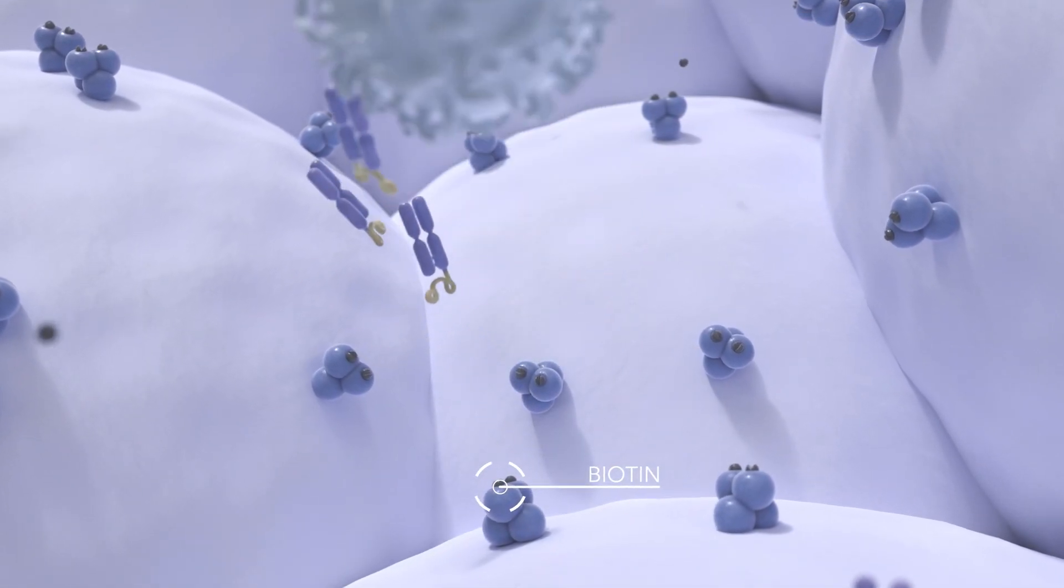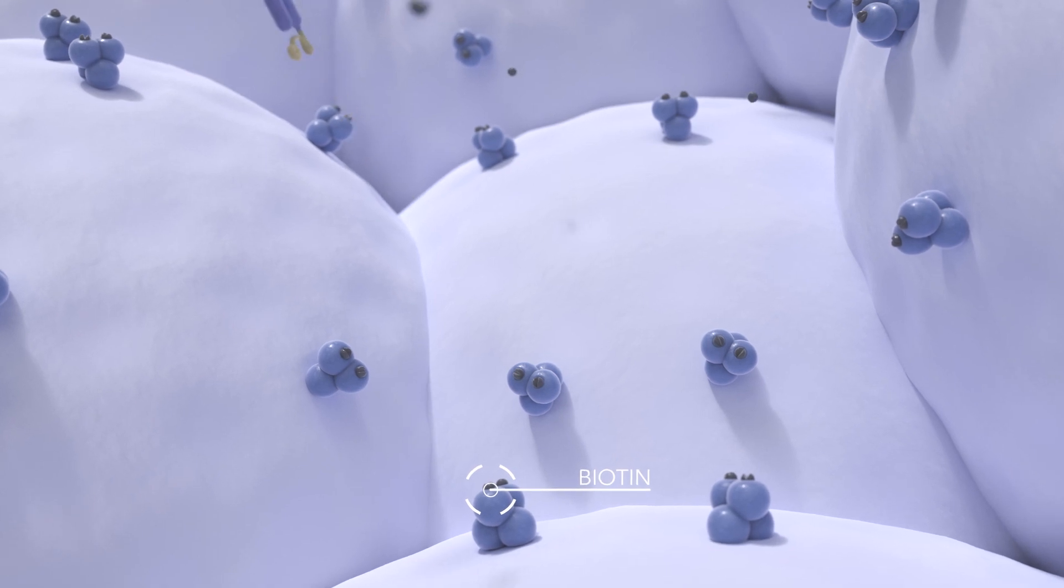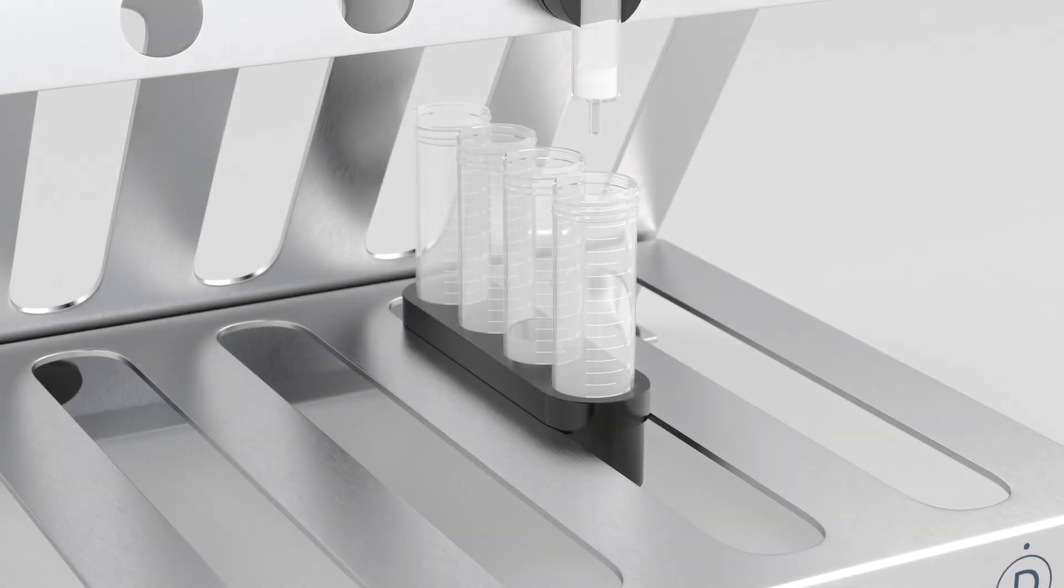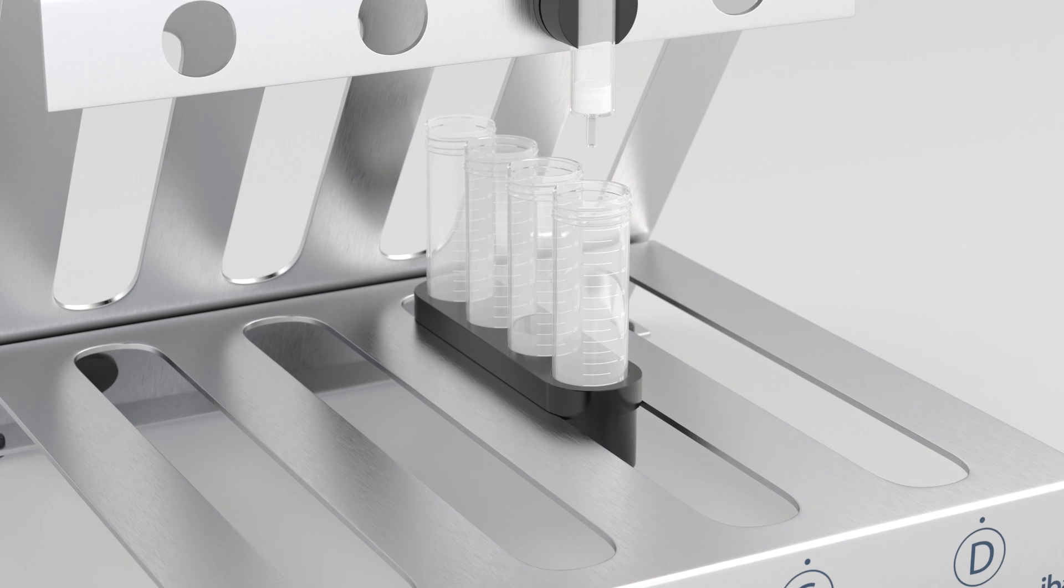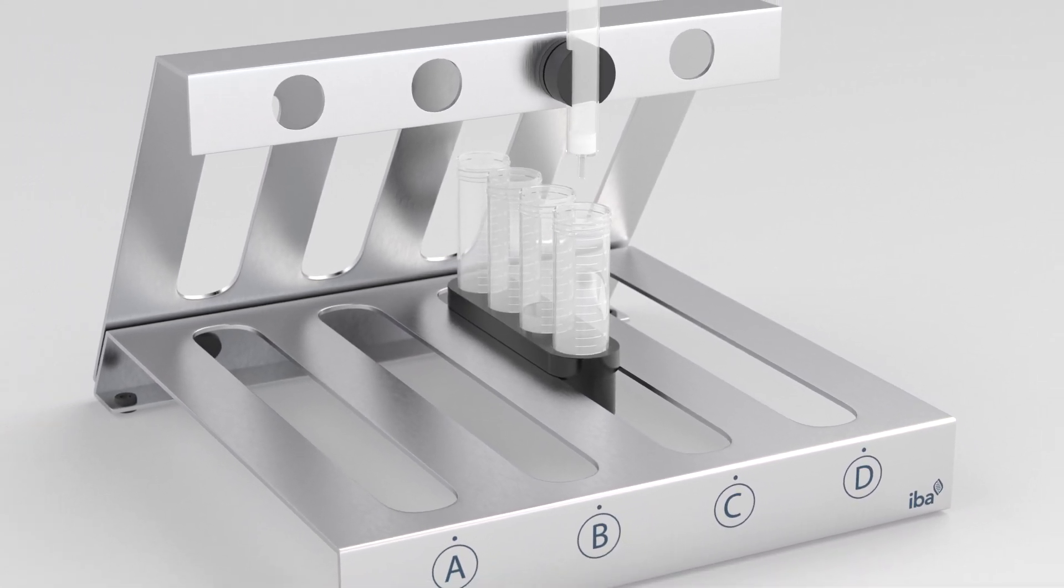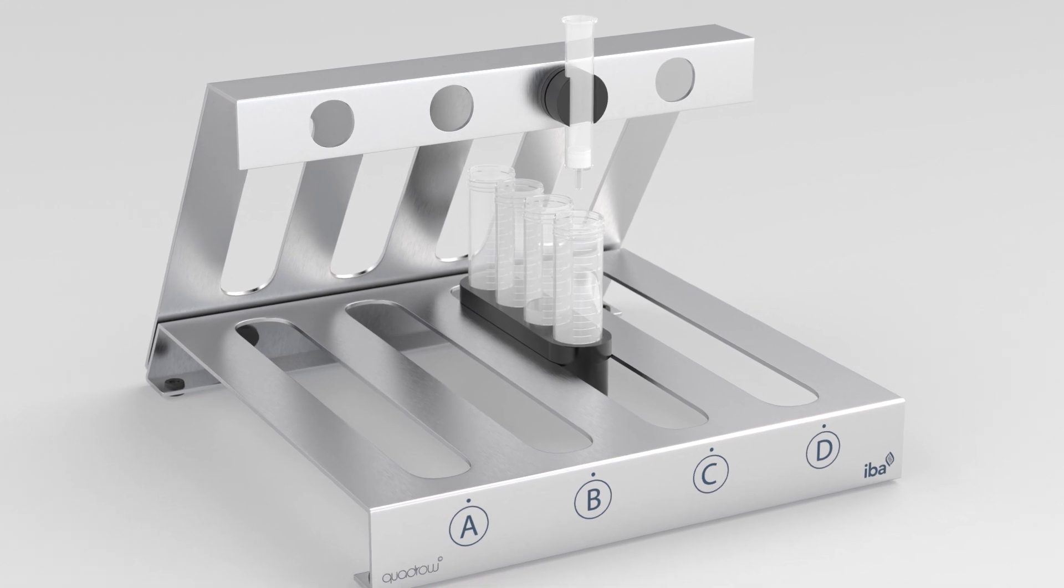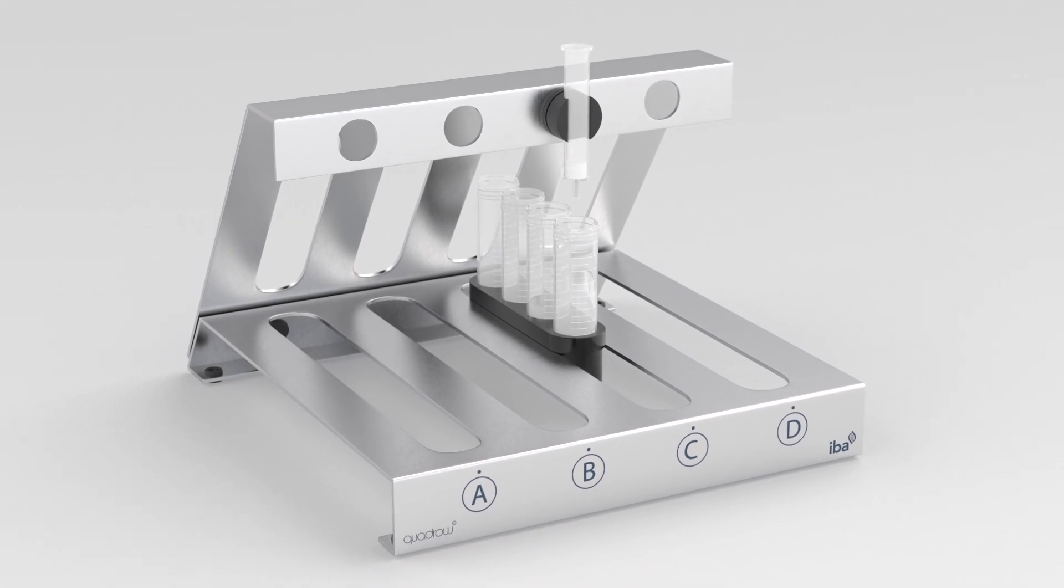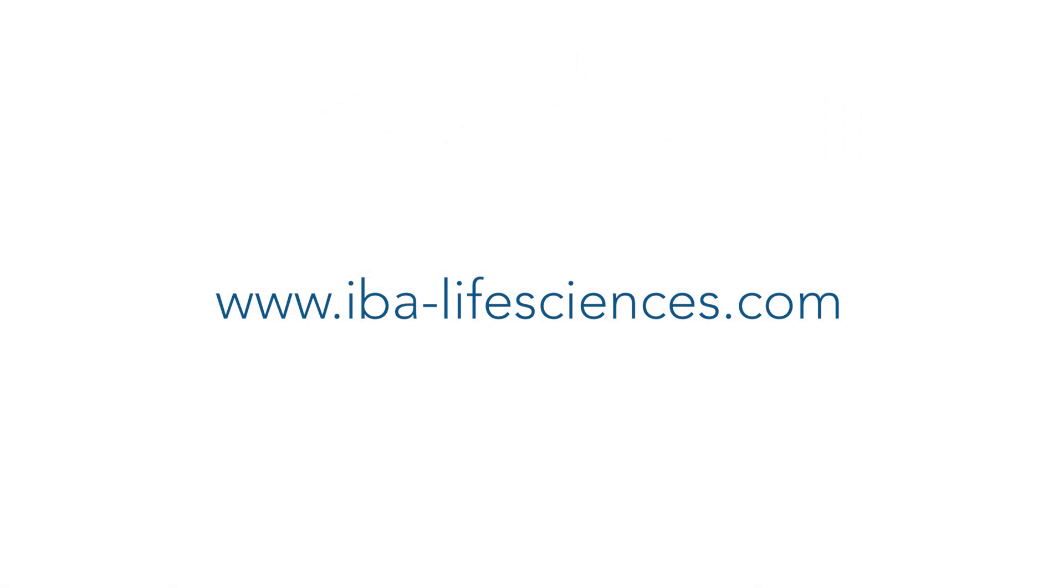This novel fab tax procedure delivers label-free, non-activated target cells of highly reproducible quality and purity, directly from a variety of single-cell suspensions, for example, whole blood, buffy coat or rodent spleen, allowing a multitude of downstream applications.